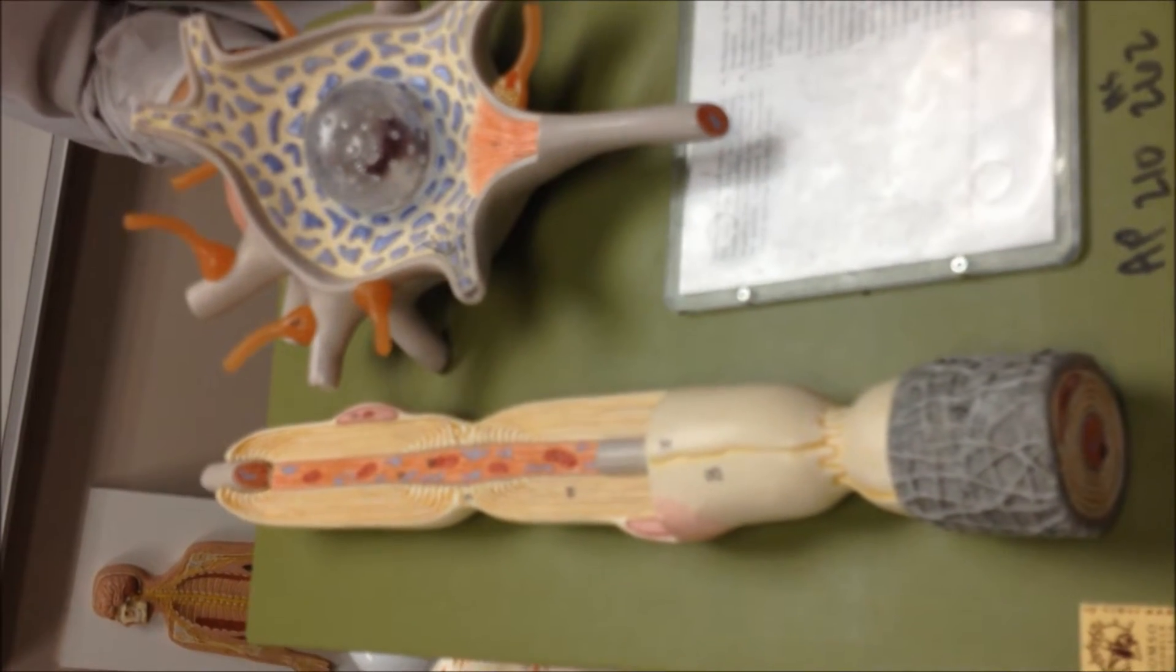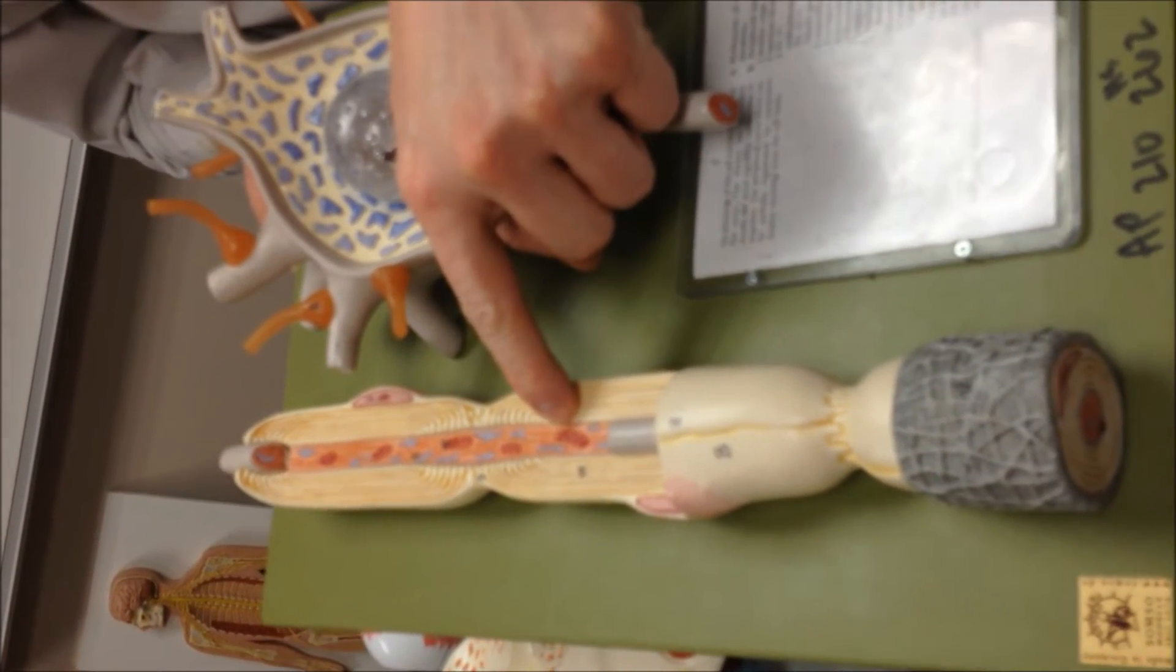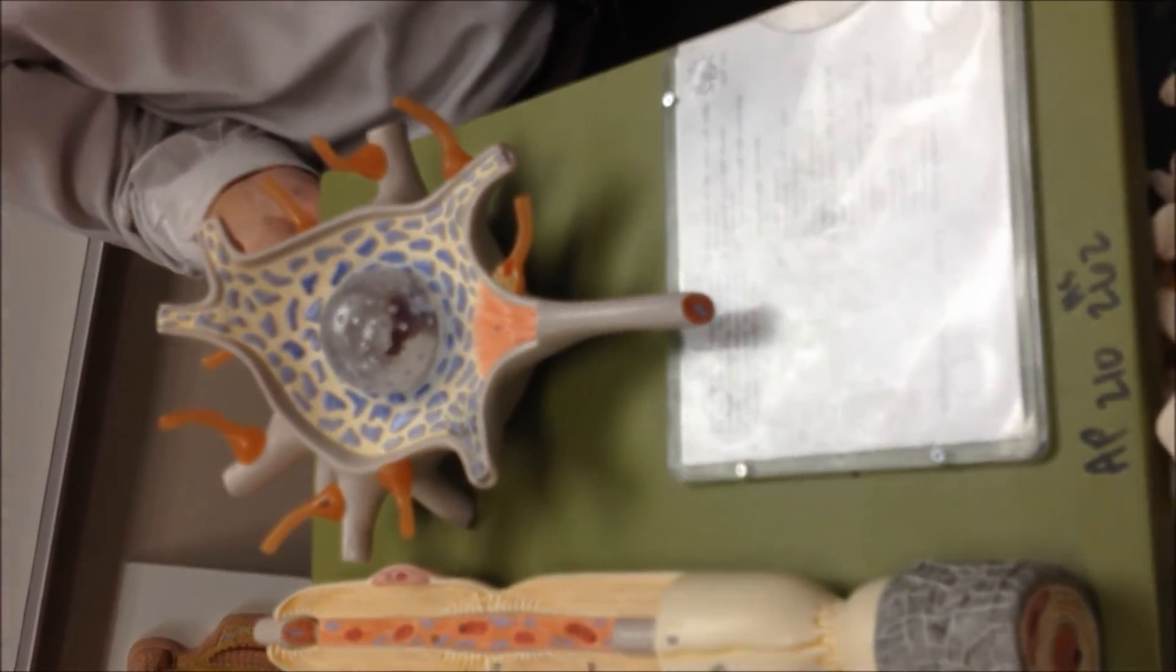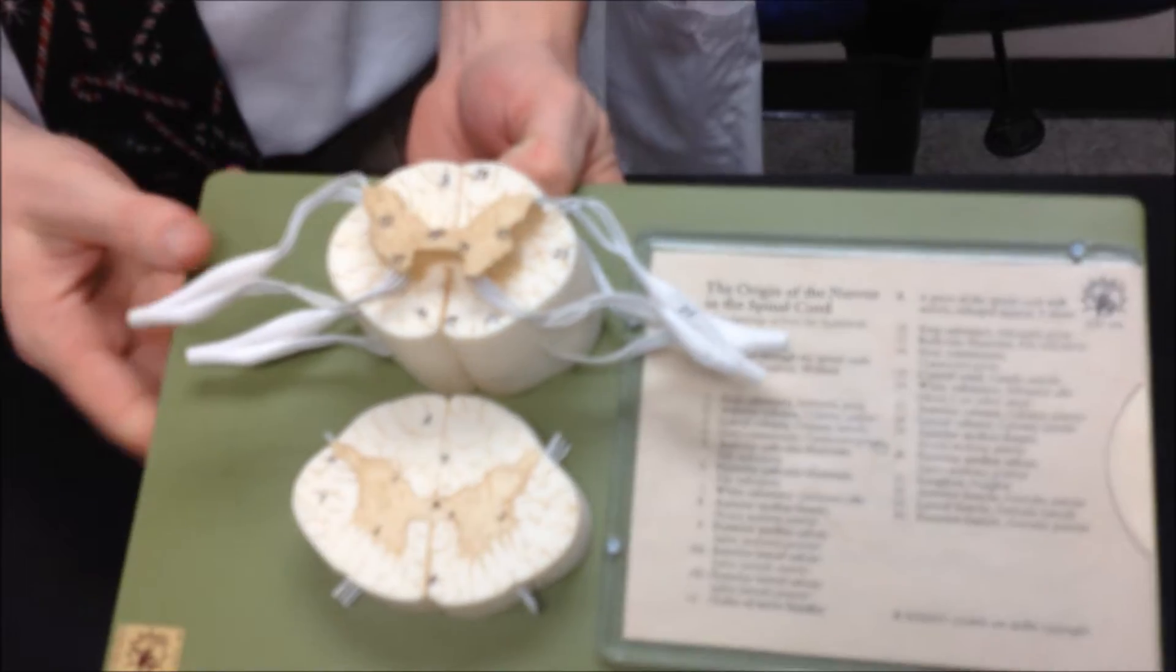And then the little pink things were the nucleus? No. Oh, that's the nucleus of the Schwann cell. Okay. That's what I thought you said. I just wanted to make sure.